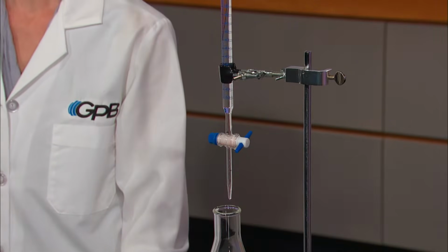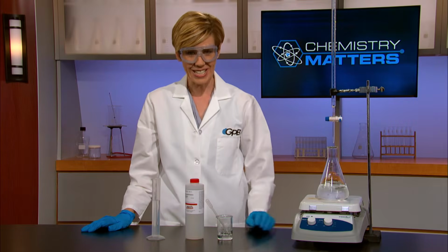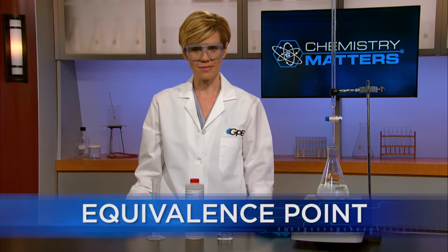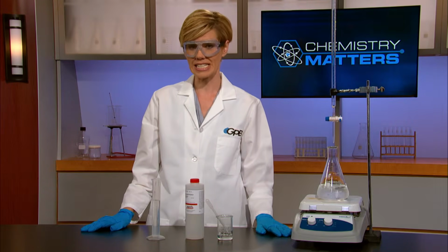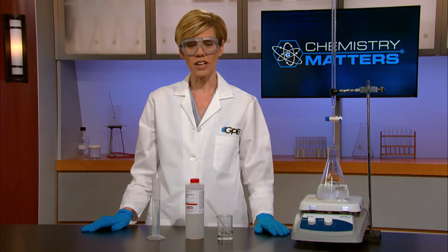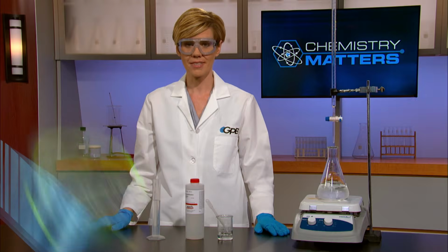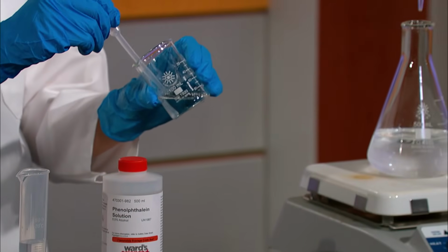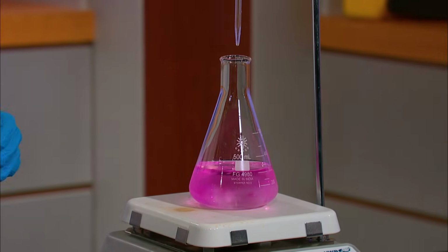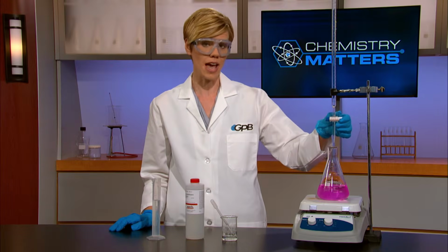For this lab, we'll plan to use a neutralization reaction, allowing the acetic acid to drip very slowly into the solution of unknown concentration. But wait, we need a way to know when the mixing of acid and base has caused neutralization, called the equivalence point of the reaction. We can visualize the end point by adding a chemical indicator. The indicator, well, it indicates by changing color. Many chemical indicators exist, and they're chosen for their ability to change color at a specific pH range. You can find a list of useful chemical indicators in our Chemistry Matters toolkit. I'm using phenolphthalein. It turns pink in the presence of a base. See, it's pink. Using this burette allows us to know exactly what volume of our known acetic acid is needed to reach the end point.